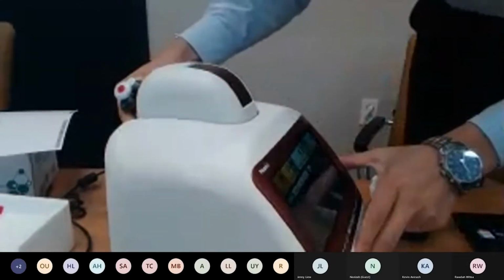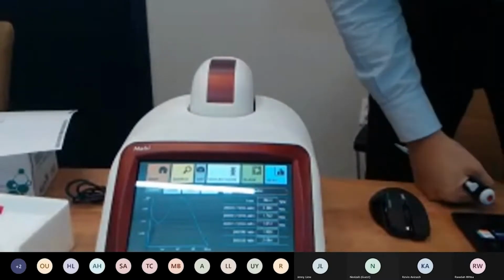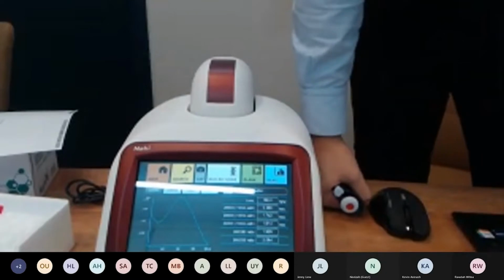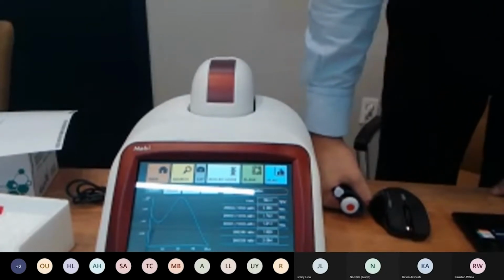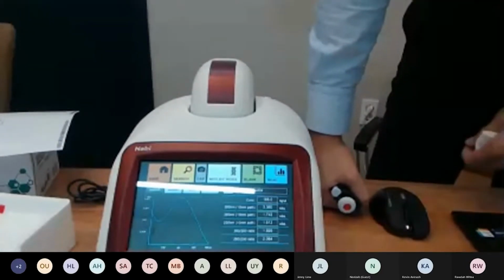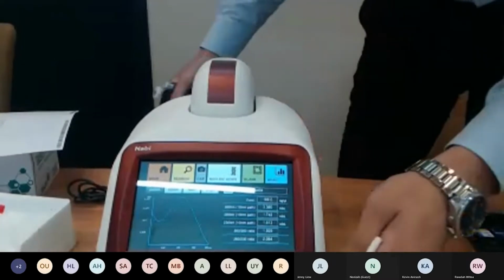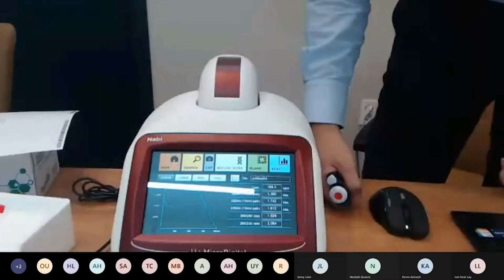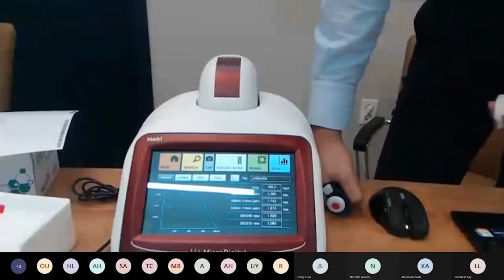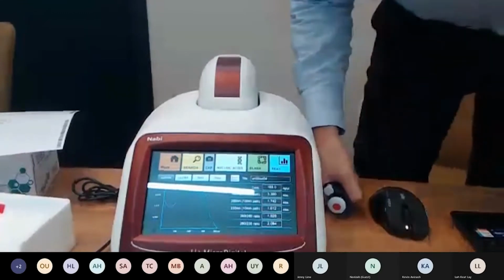Sorry about that. Yep, finally the blank is correct. It's been a while, so if you look at the results, it's 168, so it's 3 different from what we measured in the beginning, in the morning. So about 3 over 168. The CV for most of our measurements is around 3%, less than 3%. Not for most, for every measurement, it should be less than 3%, and with 3 over 165, it should be about 1.8%.